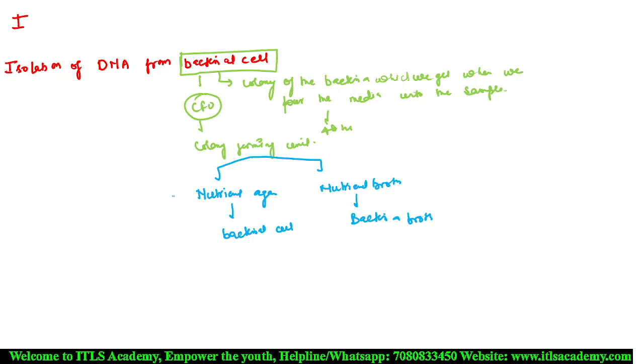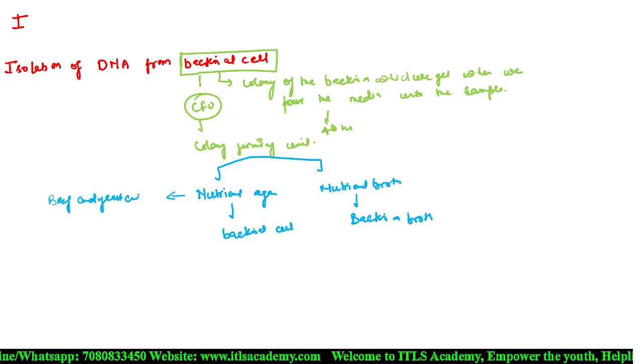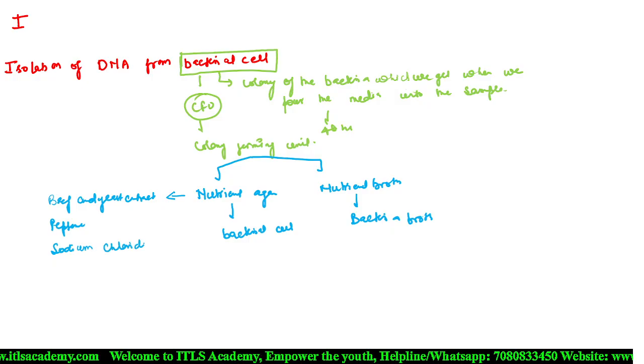Now, this nutrient agar is composed of different chemicals like beef and yeast extract, peptone, sodium chloride, and agar.